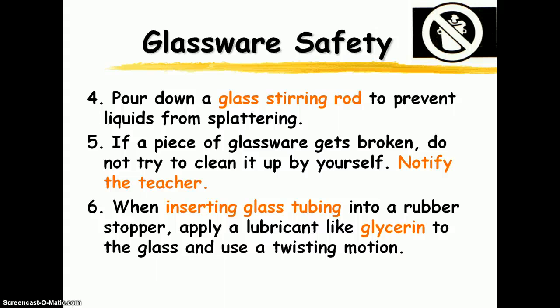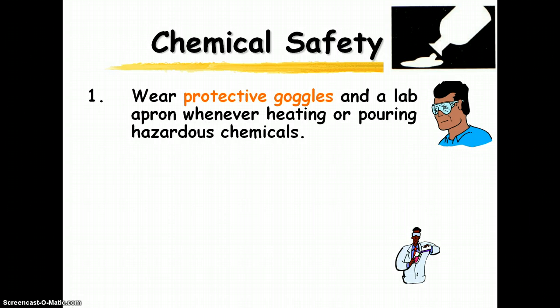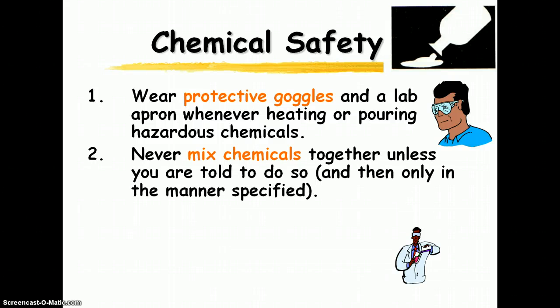If glassware breaks, notify me. We will be using rubber stoppers, and if for some reason we're using glass tubing, I'll demonstrate how to insert it using glycerin. Do not place hot glassware in water — there's a good chance it will shatter and glass will fly everywhere. Don't ever mix chemicals — this kind of goes along with don't take an experiment any further than what the instructions tell you to do. If you're interested in trying something creative, let me know your idea and in most cases I'll say it's a great idea — but let me assess whether it would be safe first.